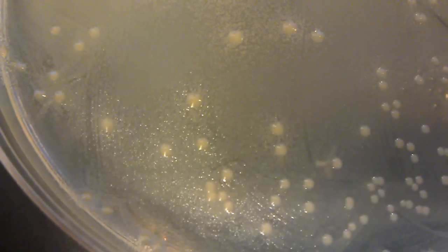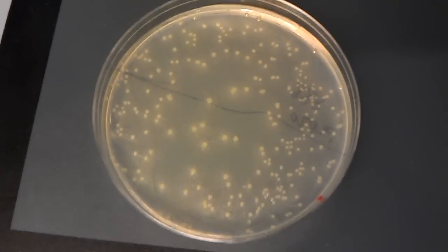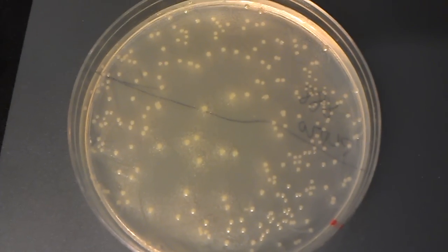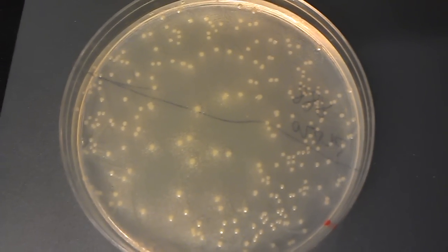Hey guys, I just really quickly wanted to talk about ampicillin plates and satellite colonies. So ampicillin is a very commonly used antibiotic. It's a very convenient antibiotic to use because you don't need to do any sort of recovery. You can just transform your cells, and you can see here we have a plate that is good to go, and it's cheap, but it has a few disadvantages. One of the big disadvantages is satellite colonies, and that's what I want to talk about here.